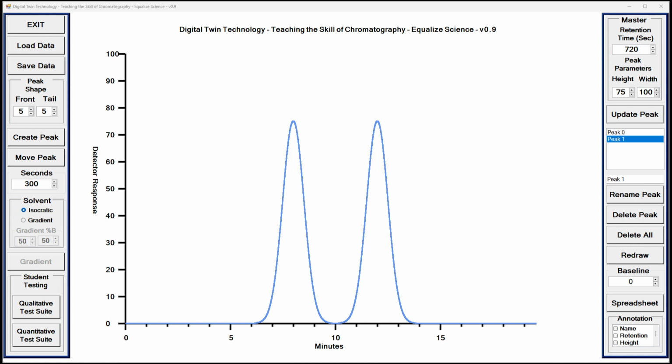Overlapping peaks can impact both the accuracy of the peak area computation and the peak retention time. If you are developing a qualitative analytical method to be used in various environments, it may be necessary to stipulate in the method definition a minimum resolution for 2 or more adjacent peaks to assure a successful analysis.